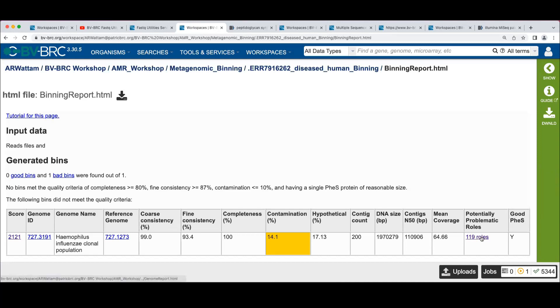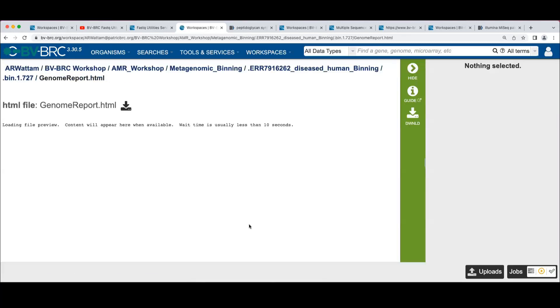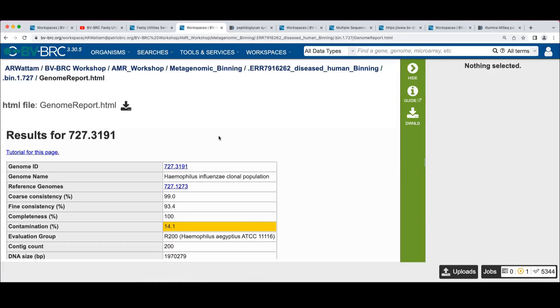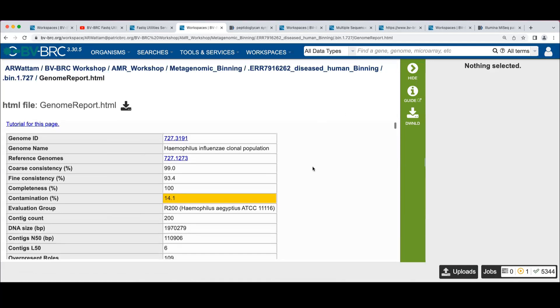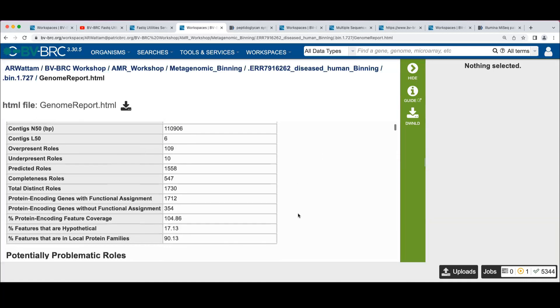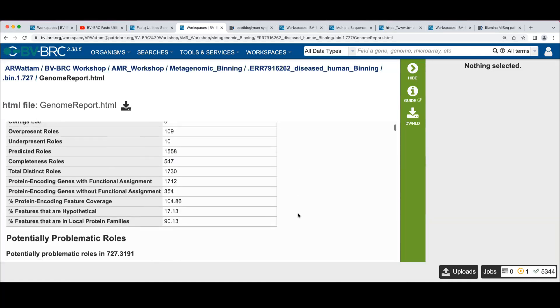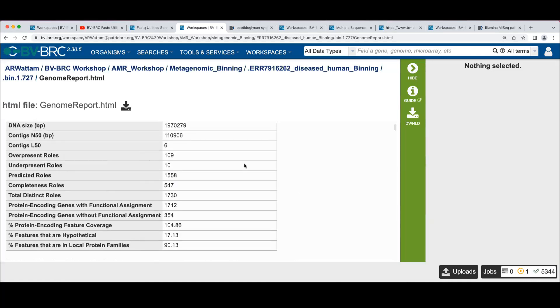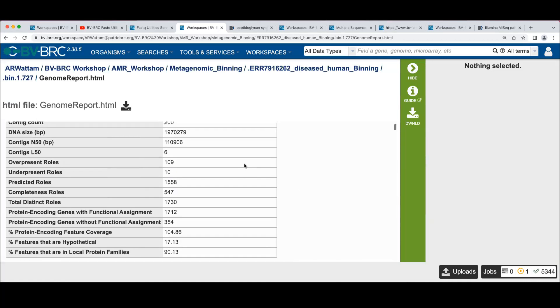That takes us to the report page for the genome. And I'll get into where this shows up in a sec. This sort of recapitulates the information we saw before with some more information that comes out of the predictor. So this data comes from the same predictor that came up with the consistency numbers.